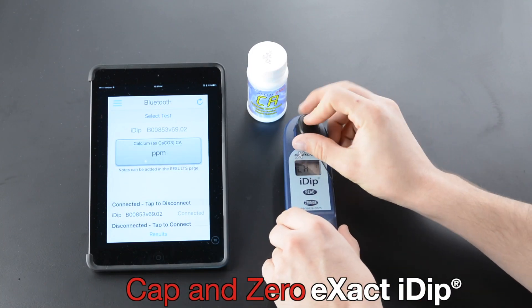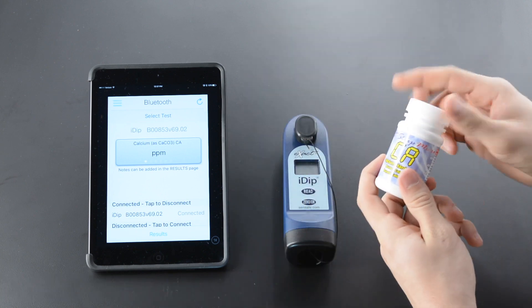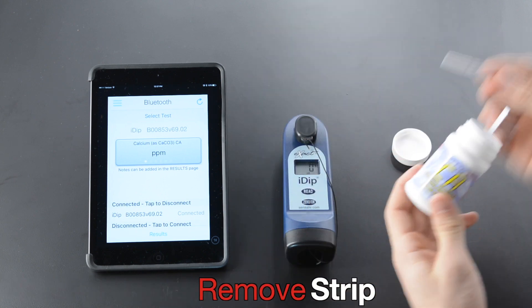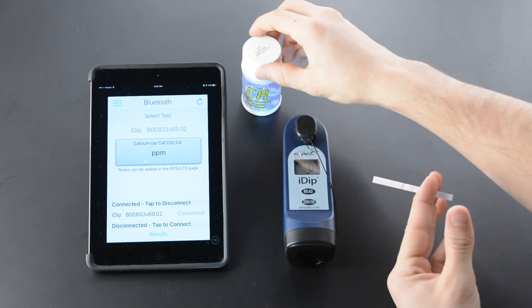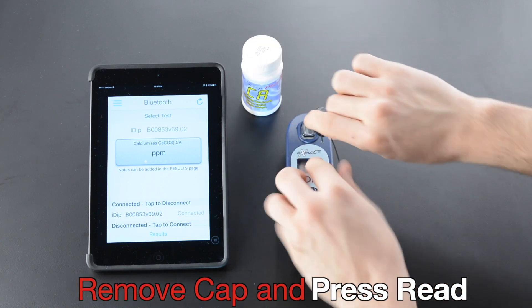Select Test. Cap and zero XactiDip. Remove strip and replace lid on bottle.